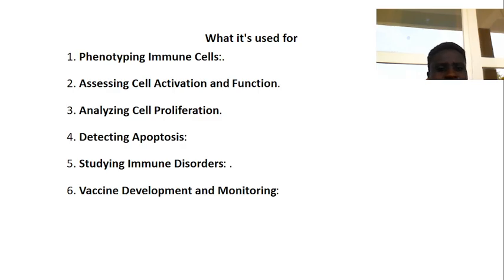How they are used for phenotyping cells, used in the cell activation function, and to analyze cell proliferation, how cells are growing from the progenitors to the precursors to the mature cells. It is also used to study immune disorders, and to develop and monitor vaccines.